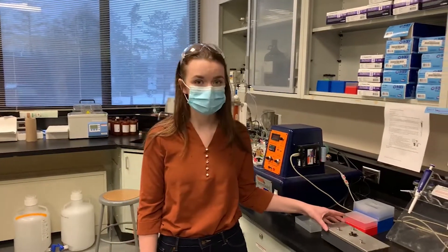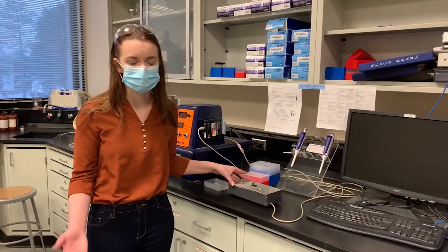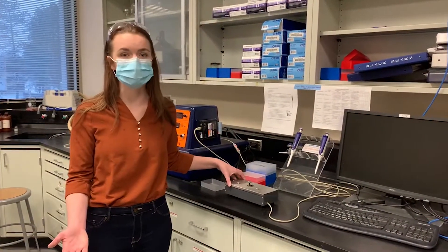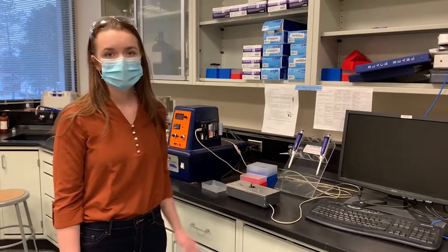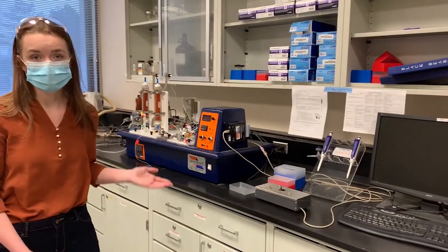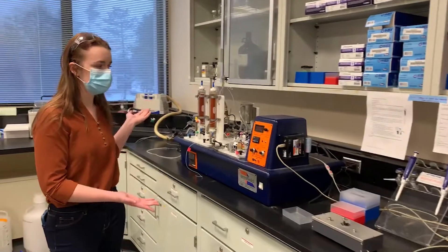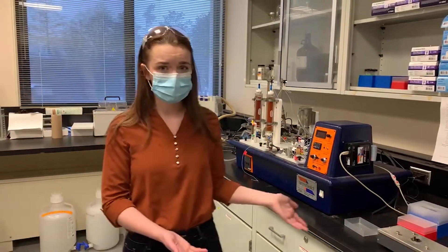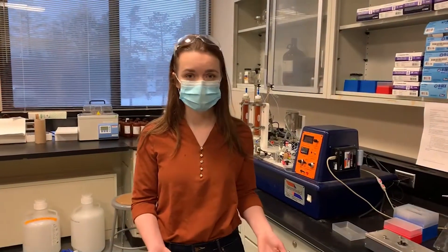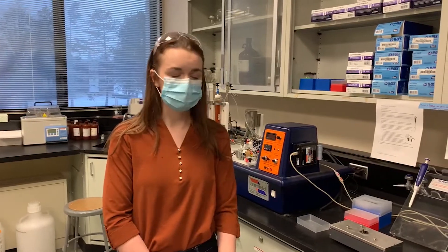We can test that using analytical instrumentation like the spectrophotometer here, which measures the absorbance of light from your sample, which we can use to calculate the concentration of your reaction products outside of the reactor. So that's a brief overview of how these types of labs work: you have some kind of reactor scheme, some kind of process, and then you use analytical instrumentation at the end to analyze your samples and get your final results.